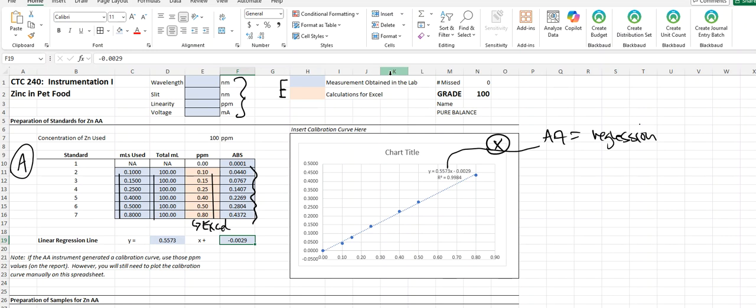So I just want you to keep that in mind as you go further into the sample analysis of why things aren't perfectly aligning up on your side. And that's not a big problem. That's just the difference in the regression line types that we are using versus the instrument. But it's also why we prefer the number on the instrument better.